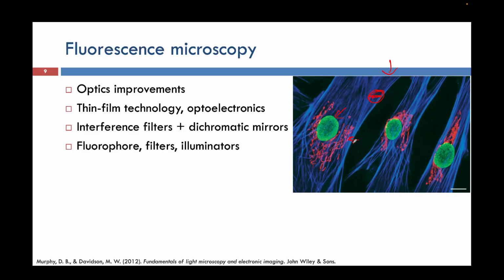We cannot use fluorescence microscopy for all of our general samples. It has a specific purpose, and the sample should be able to radiate fluorescent rays. In fact, when an electron interacts with matter, fluorescent rays come out, but the amount of fluorescence that the matter gives depends on that.